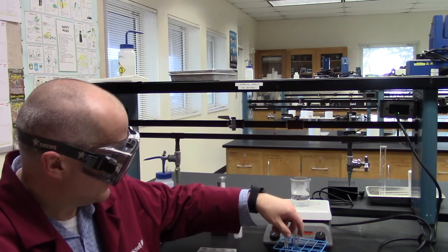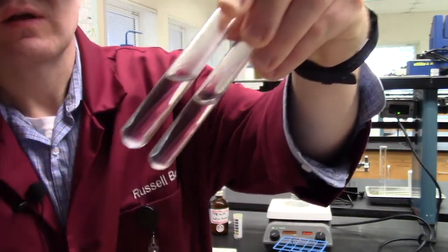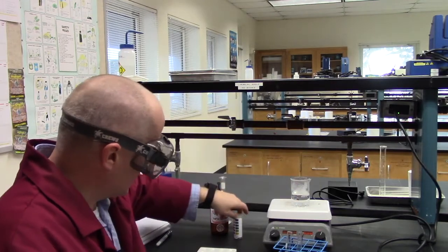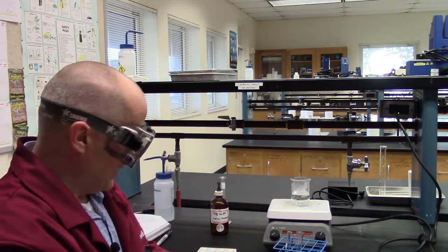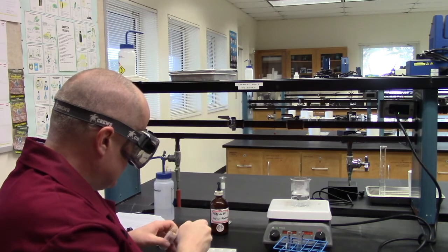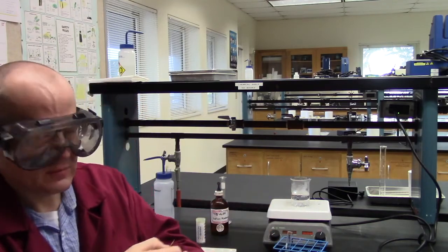Okay, guys. Now that our samples have cooled down a little bit, here's what they look like. After heating them, they got a little clearer. There you go. They're more or less comfortable to touch. So now I'm going to do a pH test. I'm going to take a piece of pH paper, which tells you the pH by color. And I want the pH of this acid solution to be 7, ideally, but if it's a little bit above 7, that'll be okay. So let's dip it into here.